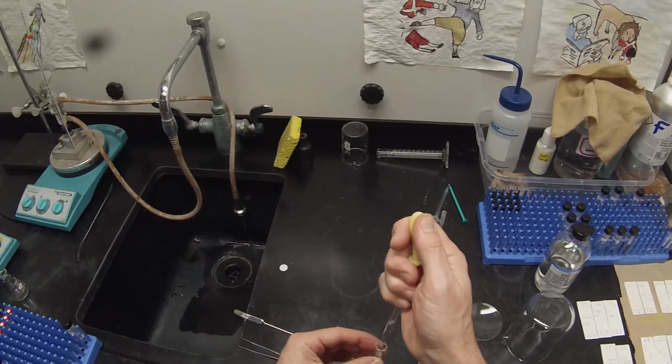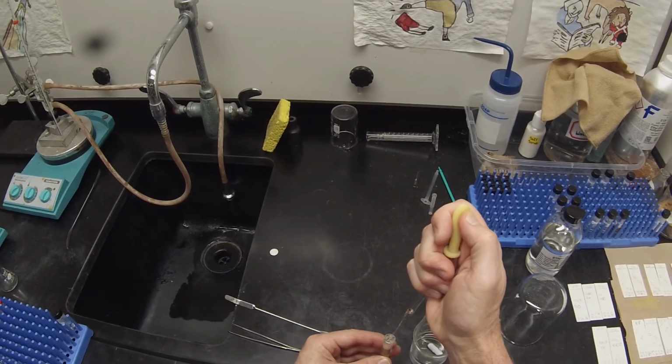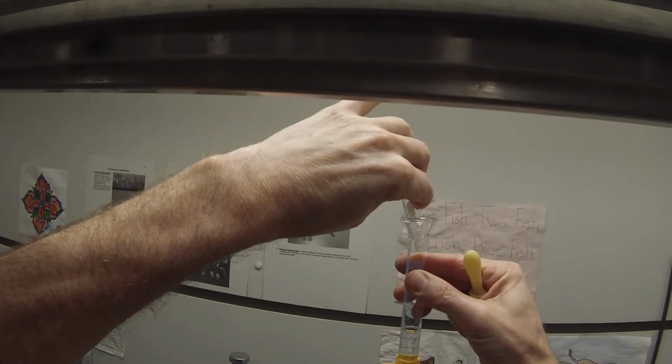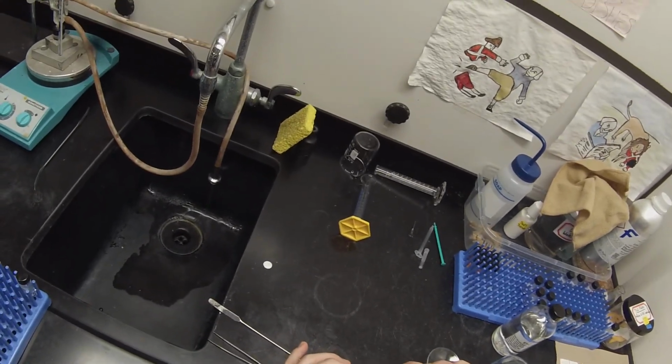Well, while we're waiting for that to boil, I'm going to use some of this solvent to measure the volume of this test tube. So that full test tube has a volume of about 4 milliliters, which means that it should fit the contents of that. That's just ethanol. So I'm going to want some cold solvent to wash the crystals with. So I'm going to pour about 10 milliliters into this little Erlenmeyer flask and go grab an ice bath to sink that in. That way that'll be ready when we need it.